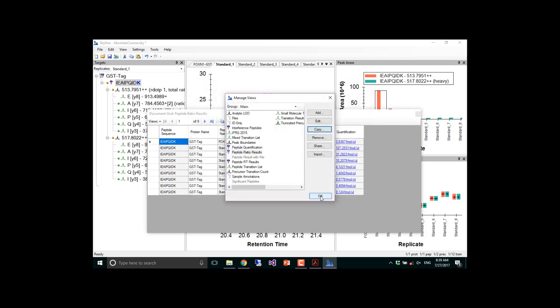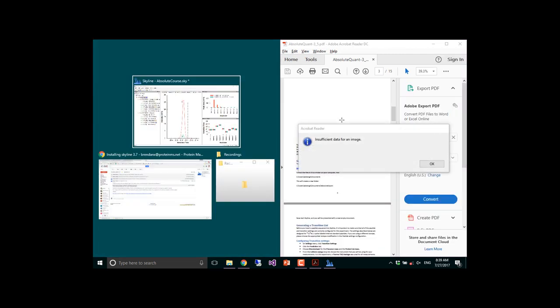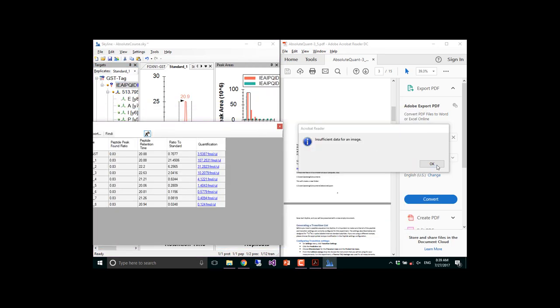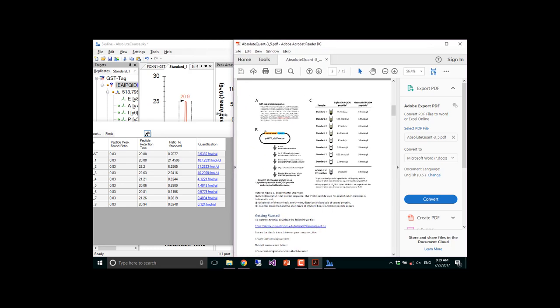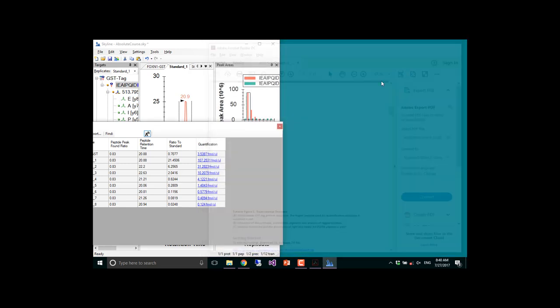So, okay, here we are back out to the quantification. We can also see estimations for these other values, which we actually know as well. So we can switch over and have a look at, let's see, can I get them side by side? Well, that's getting too small. There we go. It's hard to get them both on the screen at once.